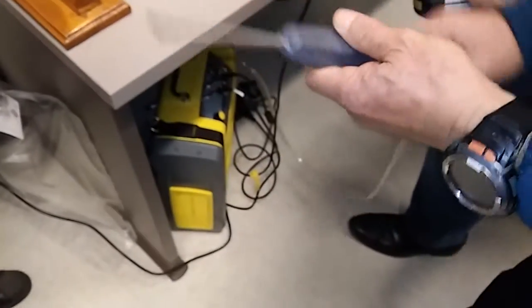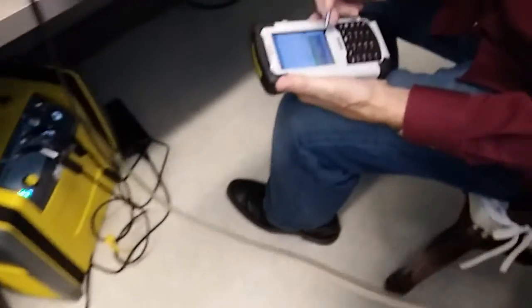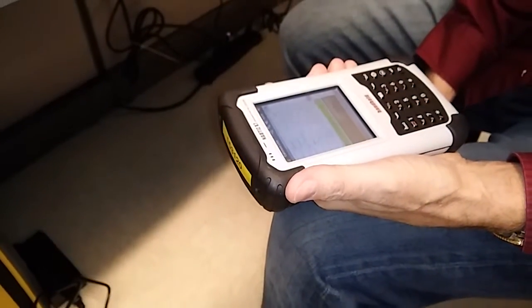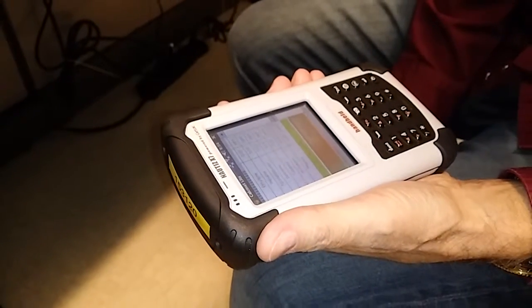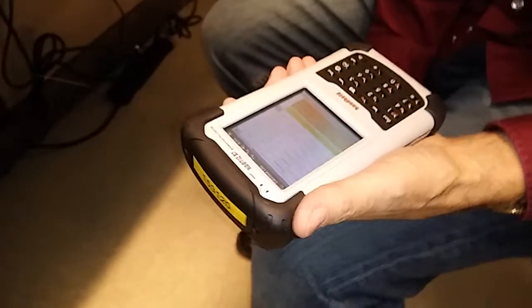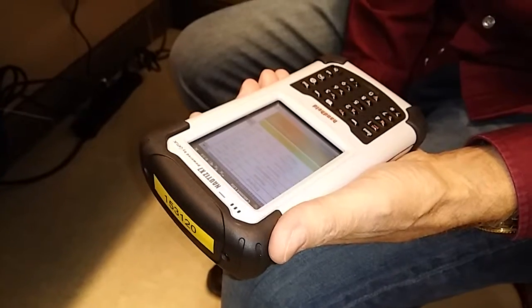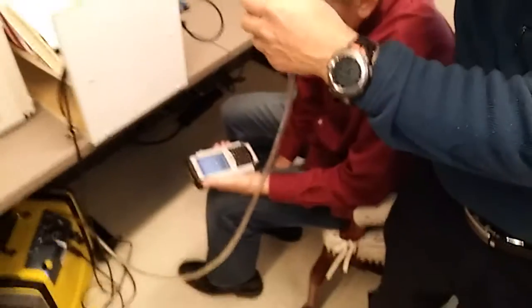Oh. So now we're going to run another single sample. Okay, we have all these people that are blowing a lot of stuff. Go measure, we'll do a single sample. And we gotta wait. How come I don't hear the fan on? Wait.